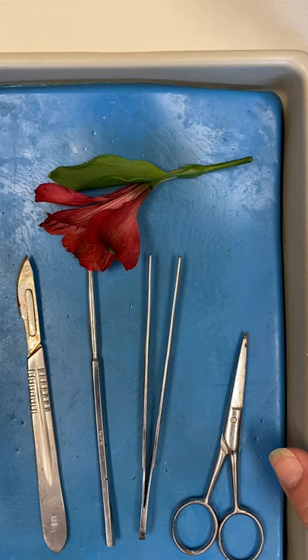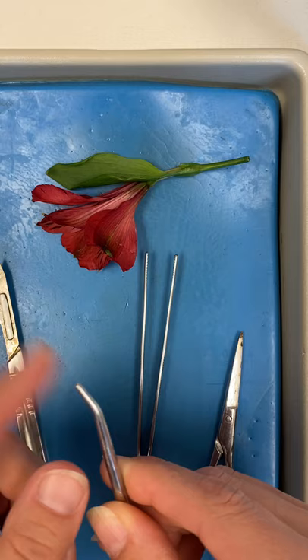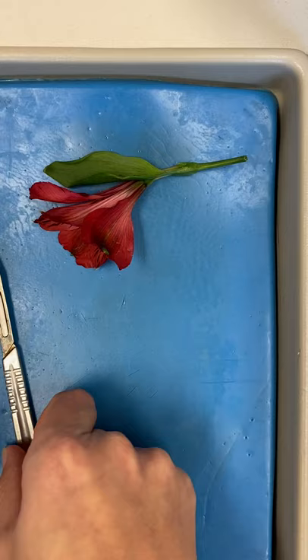Right here are my dissection materials. This is a scalpel — a sharp cutting instrument. This is a blunt probe; when I touch the end it's not going to hurt me, but it makes a good pointer or separator. These things that look like tweezers are called forceps, and we probably won't need the dissecting scissors today.